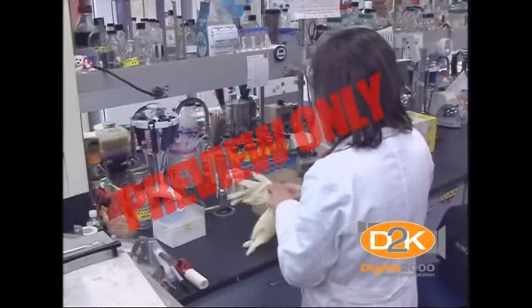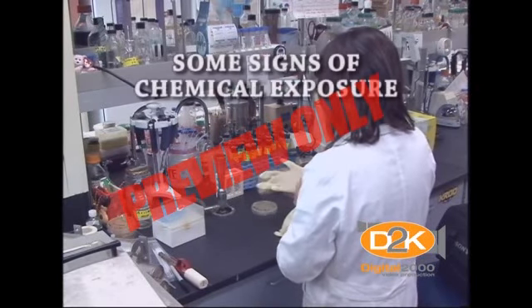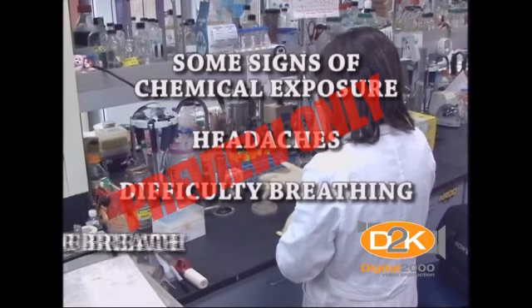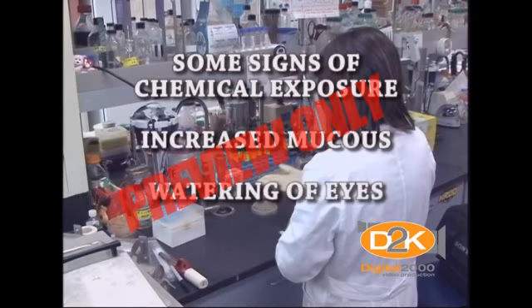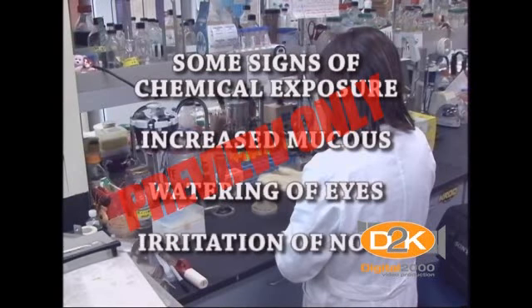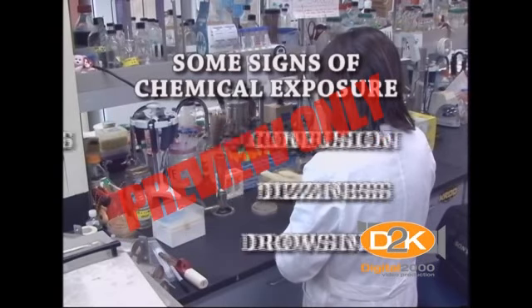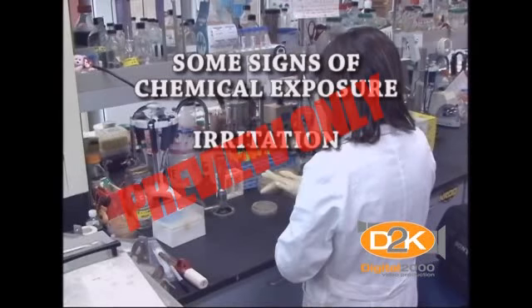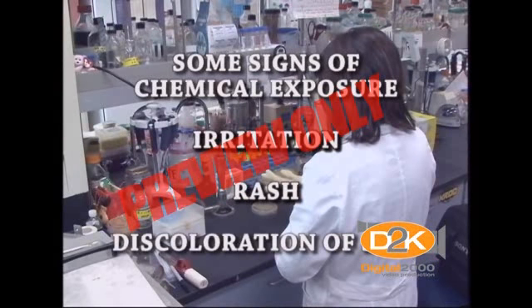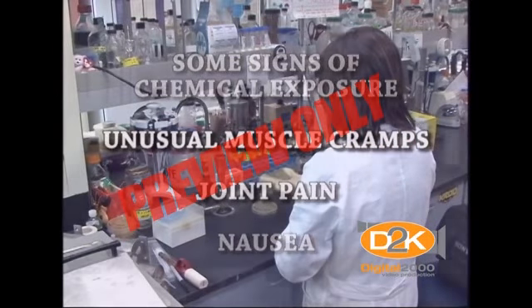You should be familiar with the health hazards associated with the toxic chemicals you use. Some signs of chemical exposure may include headaches, difficulty breathing or shortness of breath, increased mucus production, irritation or watering of the eyes, irritation of the nose or throat, confusion, dizziness, drowsiness or loss of consciousness, an unfamiliar chemical odor, irritation, rash, or discoloration of the skin, unusual muscle cramps or joint pain, or nausea.